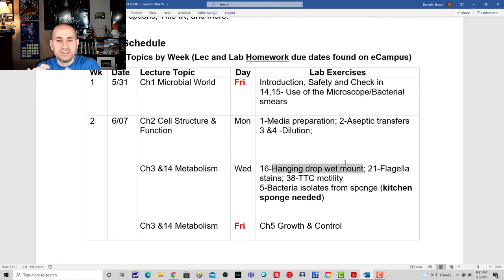And then there was fake motility. Remember, pseudo motility, where the bacteria, the S. aureus, appeared to be shaking in place. That was not a real form of motility. Remember, that was called Brownian motion. So you should know the concept of Brownian motion, that it's not a real type of motility. And you should know what causes Brownian motion. Remember, water molecules bouncing into each other and bouncing into the sample makes the sample look like it's vibrating in place.